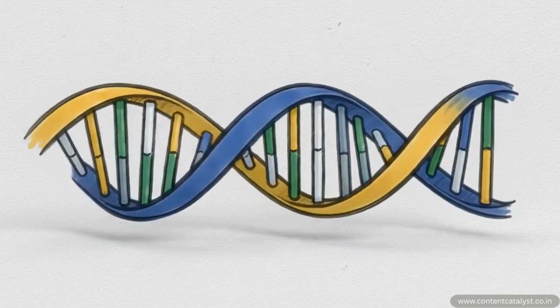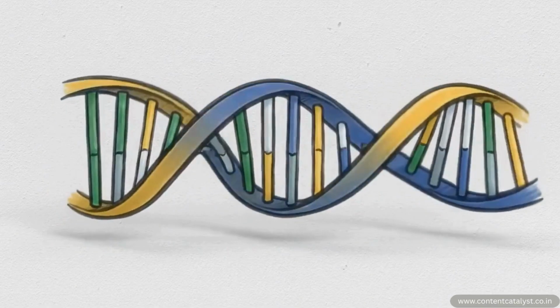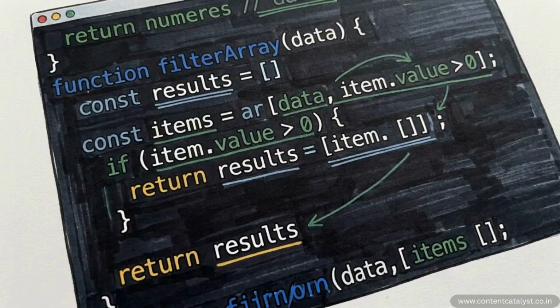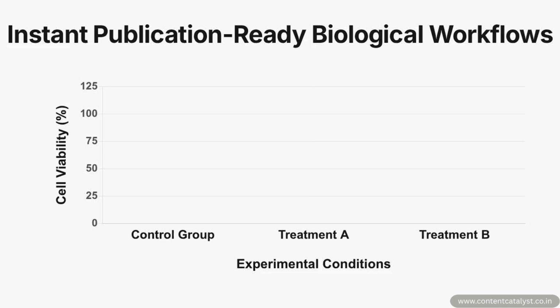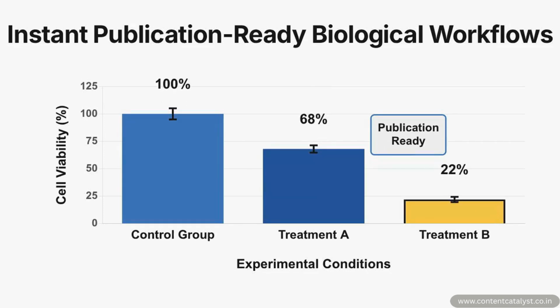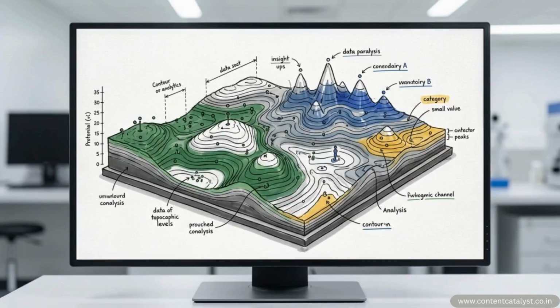With R or Python, you can write a custom script to process and manipulate literally any data structure you can imagine. You are never restricted by what a developer decided to put in a drop-down menu. Prism is built to automate the vast majority of standard biological workflows flawlessly, but if your work consistently breaks the mold, you will need to rely on code.